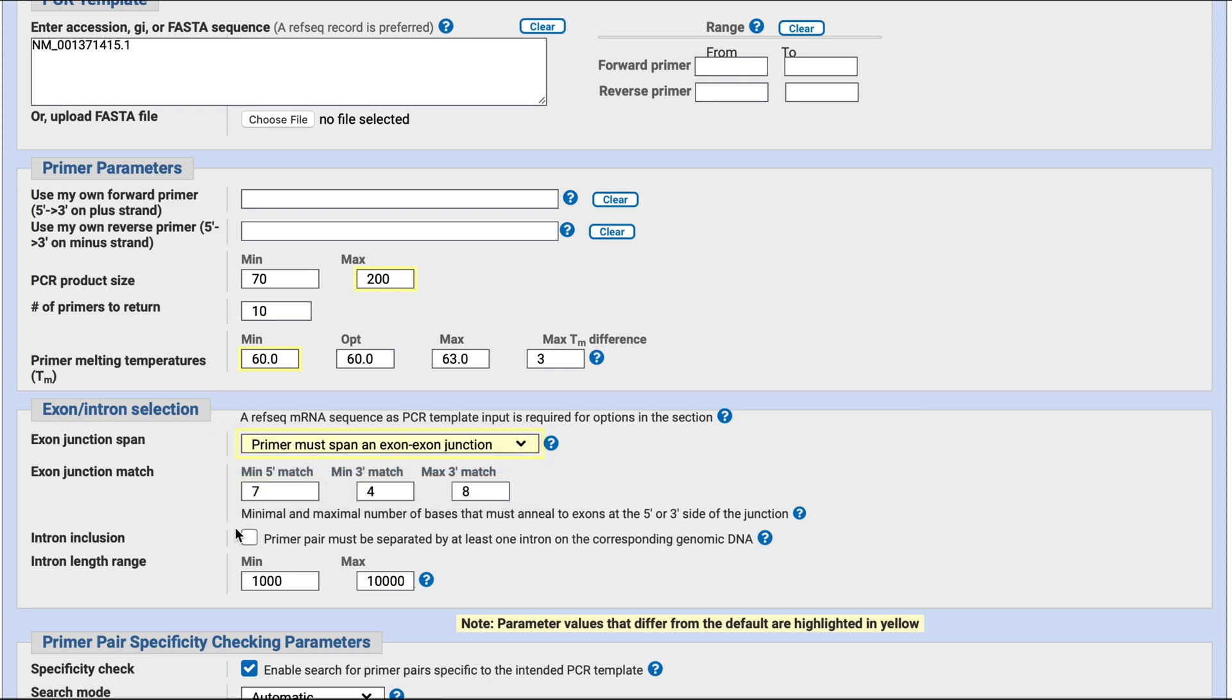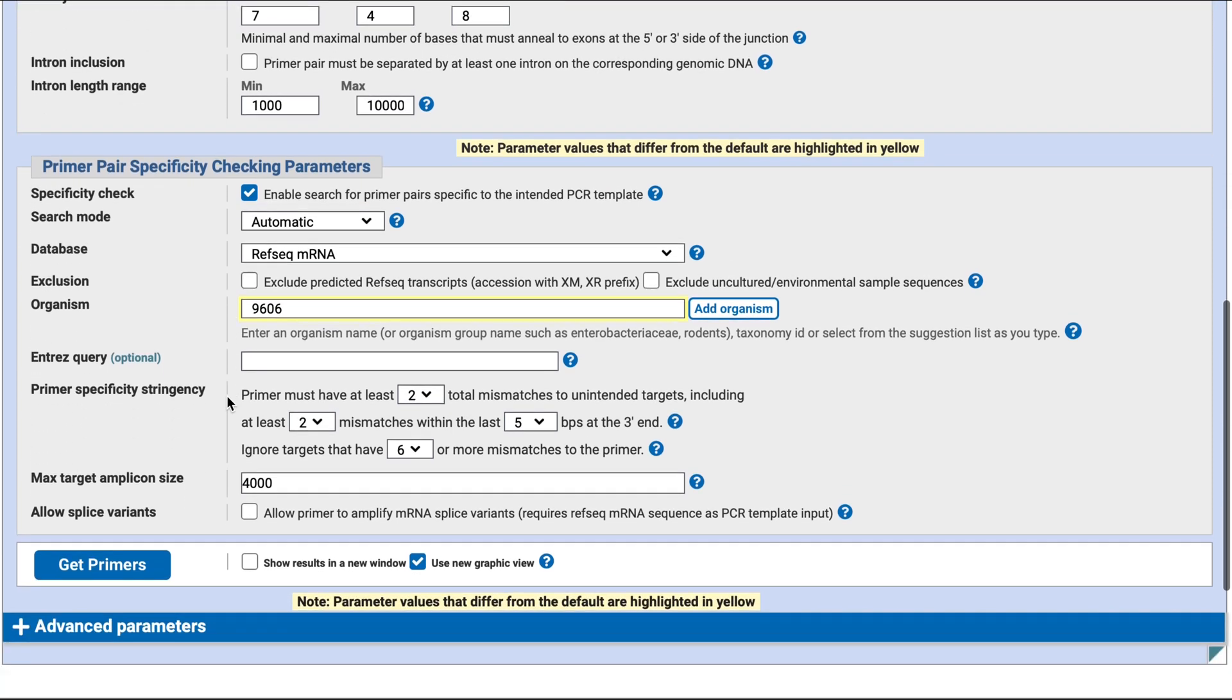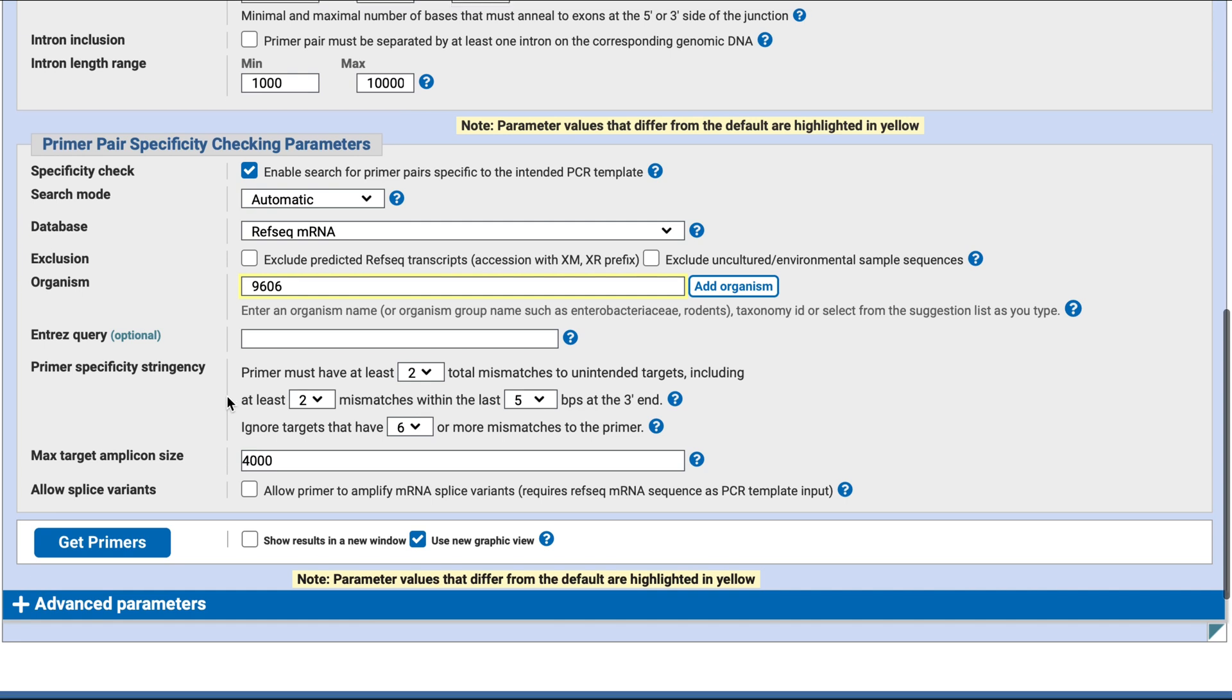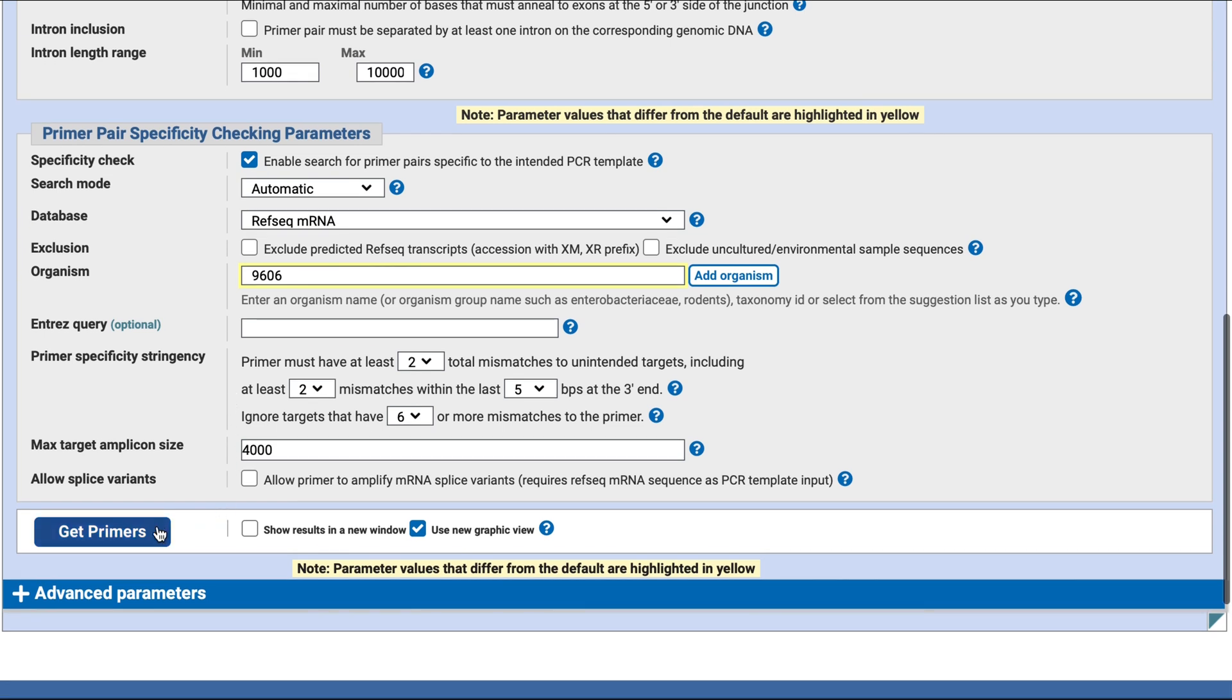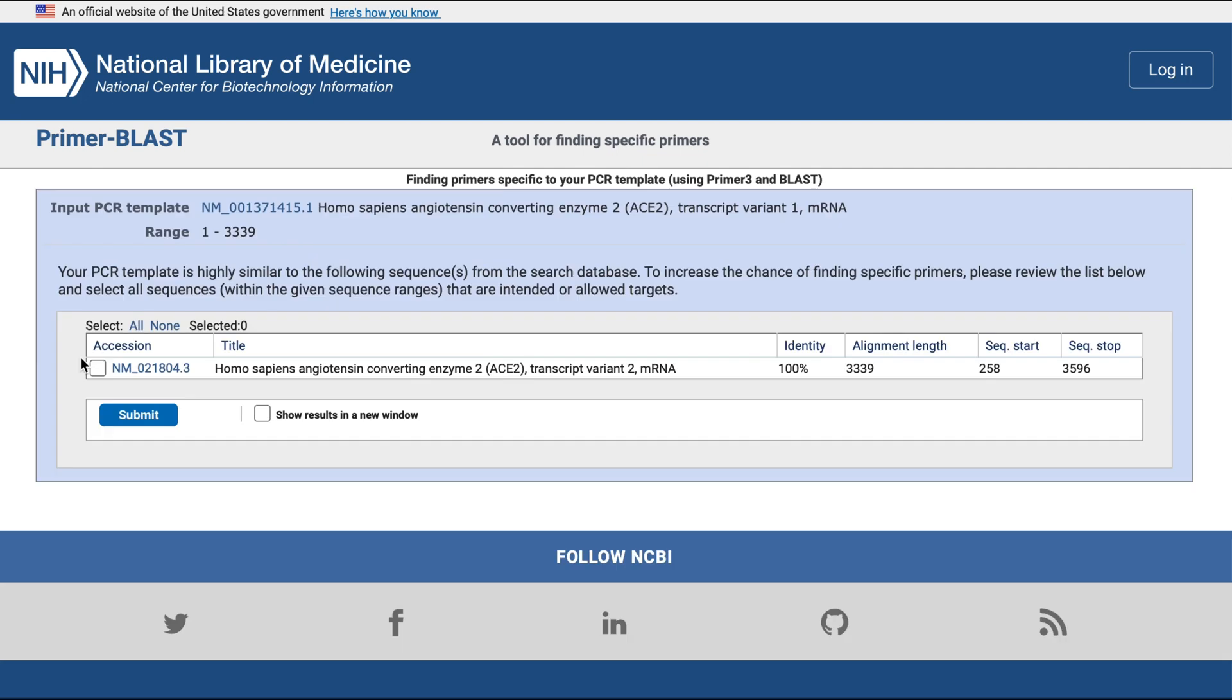Under primer pair specificity, use the default setting. The program will use the RefSeq mRNA sequence from the organism you selected to design your primers. Go ahead and click on 'get primers,' then select that and click submit.